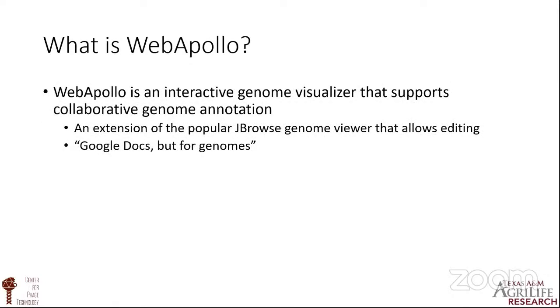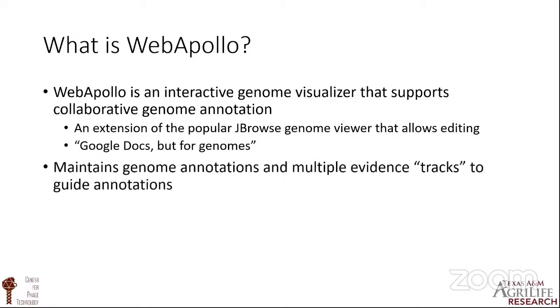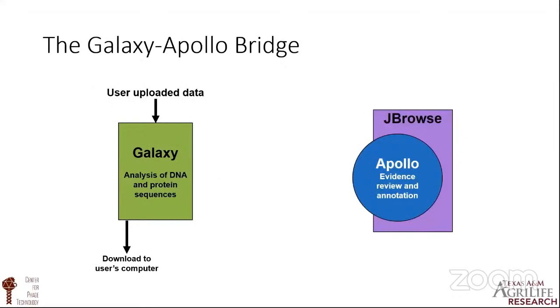WebApollo is an interactive genome visualizer that supports collaborative genome annotation. It is an extension of the popular JBrowse genome viewer that allows editing of the genome inside the web interface. It is described as a similar concept to Google Docs, but for genomes. WebApollo maintains user annotations and multiple evidence tracks to guide annotations. The CPT has developed tools that bridge Galaxy into Apollo, which are now seeing uses on our Galaxy installation and on other installations around the world.